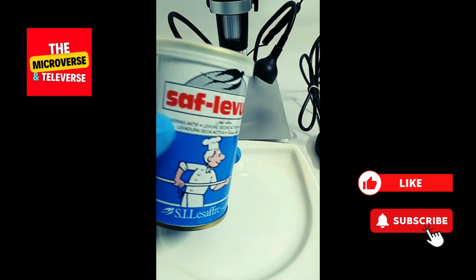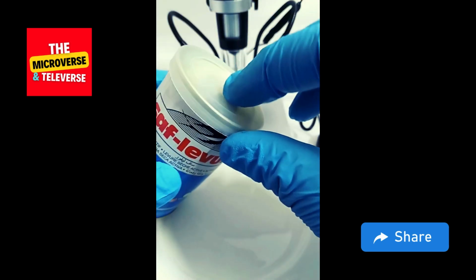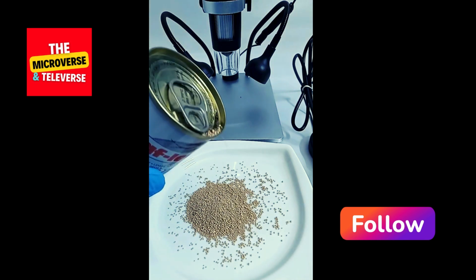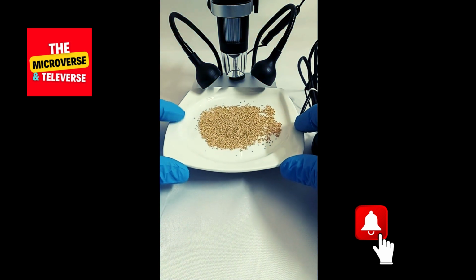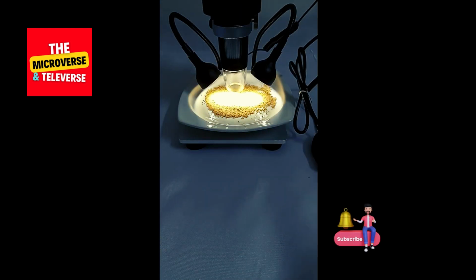Welcome to our exploration of SAF yeast under the microscope. Get ready to be intrigued as we delve into the microscopic world of this fascinating substance. But before we begin, let's take a quick visual inspection of our SAF yeast sample. As I carefully place it onto the microscope stage, we're about to uncover the hidden details within these tiny particles.